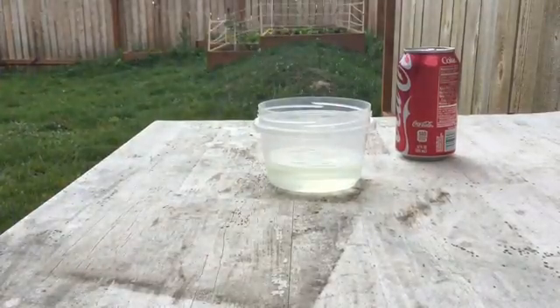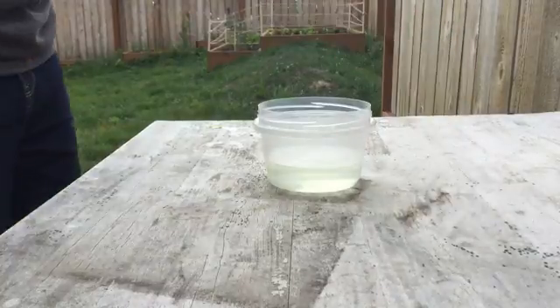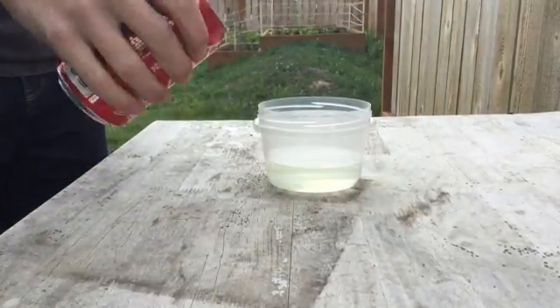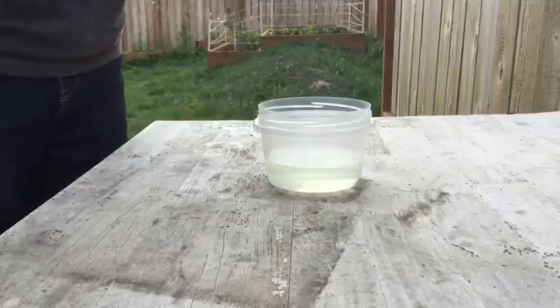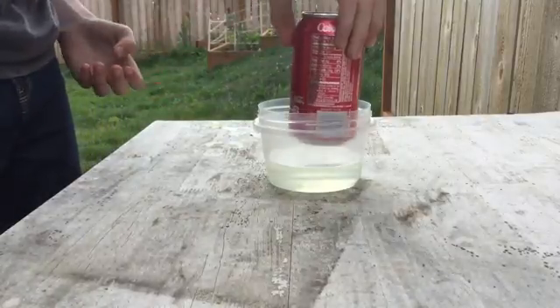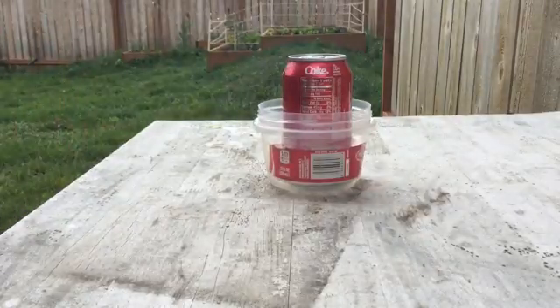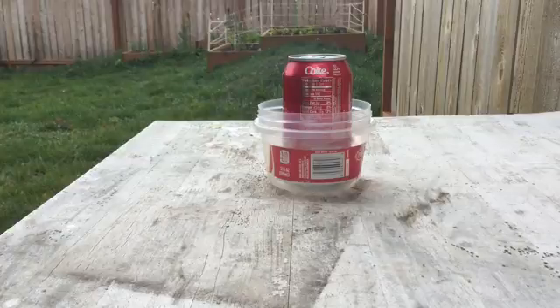This is working, it's working. Let's shake this up so it'll explode more. Now let's sit this in here. Little bubbles are forming as the aluminum starts to dissolve.